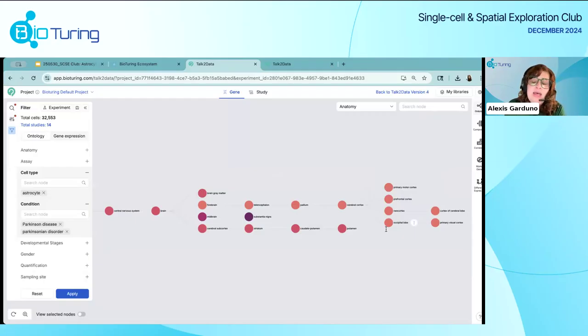So if we want to look at further transcriptional programming or reprogramming and enrichment of specific pathways within this reprogramming function, we can then perform differential gene expression from these results or these cells in these data sets specifically.